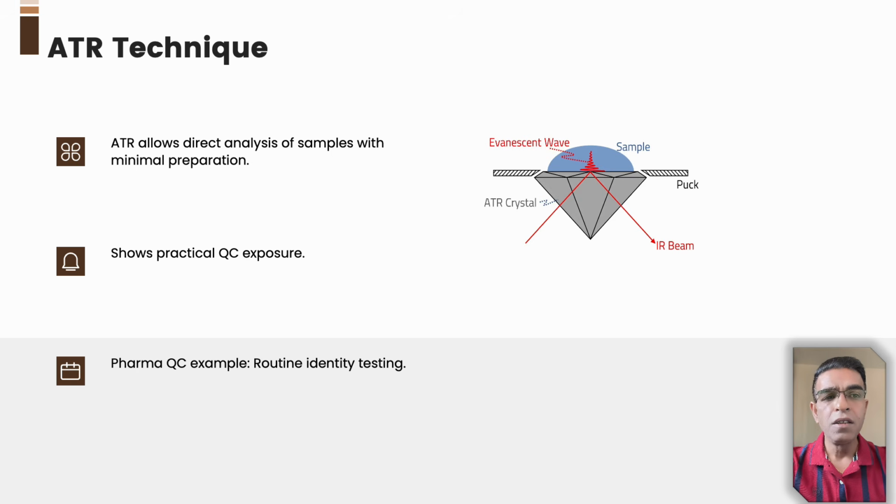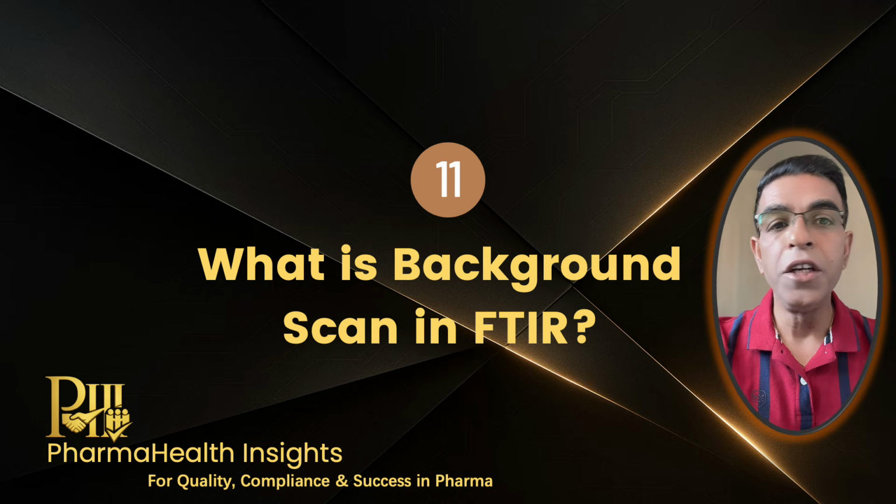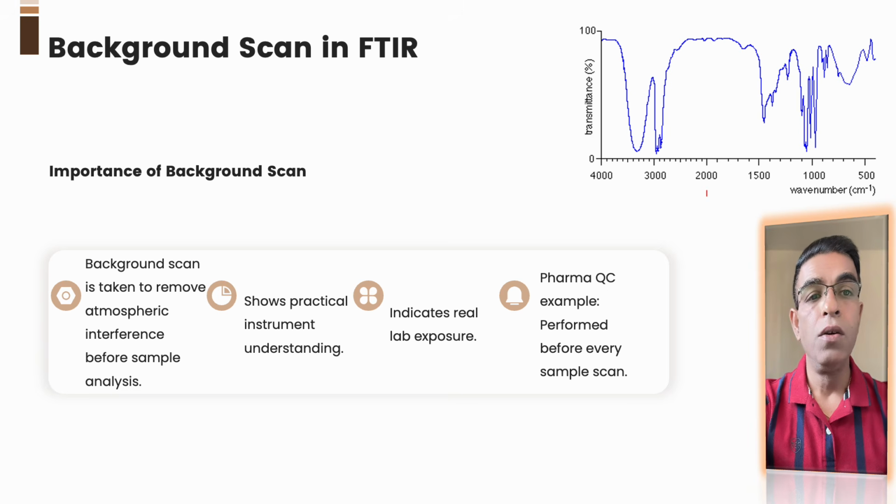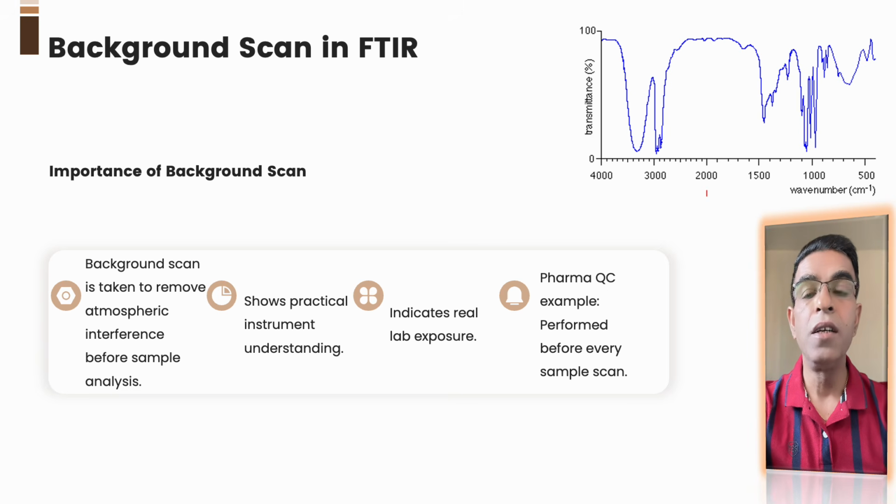Then add the practical advantage. Sir, it requires very minimal sample preparation, it is quick, and the results are highly reproducible. That's why ATR is preferred for routine FTIR testing in pharmaceutical quality control laboratories. Simple, practical, and exactly what the interviewers want from you. At this stage, the interview will move towards more practical aspects. What is a background scan in FTIR?